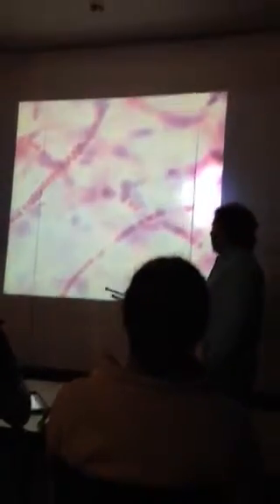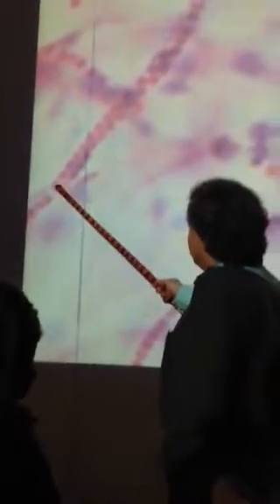Okay, these are capillaries. These are capillaries because you can see the individual red blood cells lined up, single file. This one's not, that's probably an arteriole. It's a little thicker than a capillary. But if you see a blood vessel where the cells are lined up in single file, that would be a capillary. This is a slide that is actually of a thin spread of tissue, probably like the mesothelium or something like that, or the mesentery proper, where you can actually see the blood vessels coursing through it.